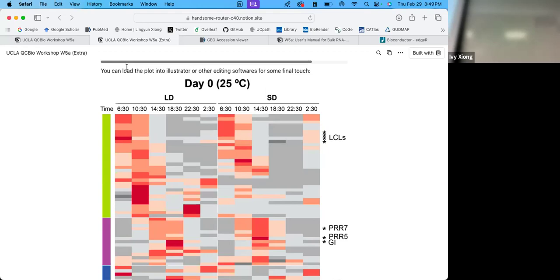I'm doing it now and I did it at home too, but it didn't matter. Apparently I submitted a job, it started, and it was 12:30 when I submitted it, I got an email. Closed my laptop, came here, and I never got a response back about it being done. Is it still running?